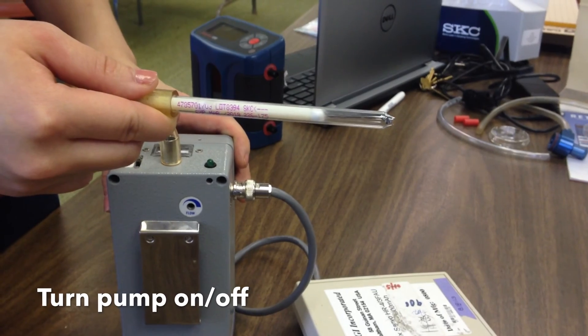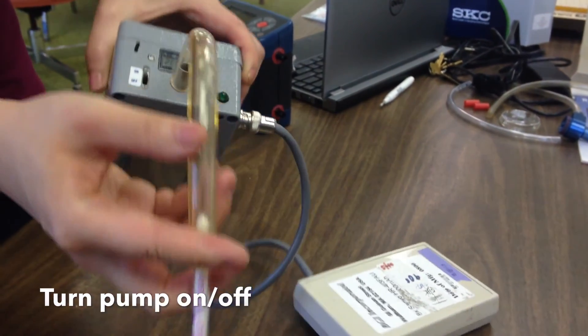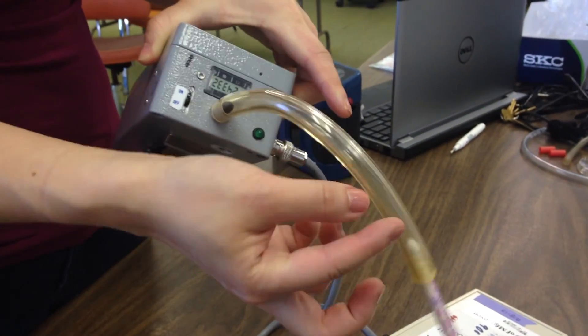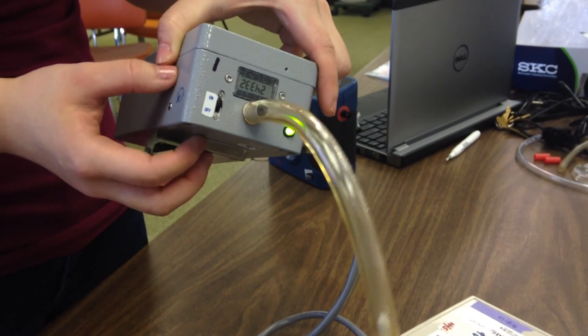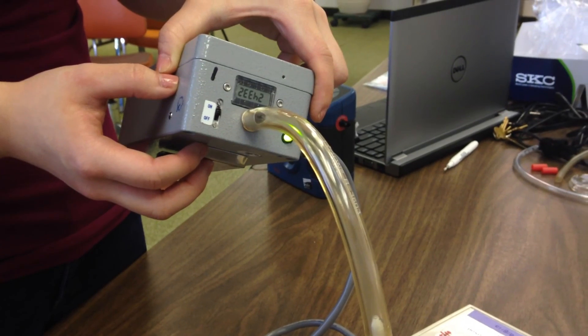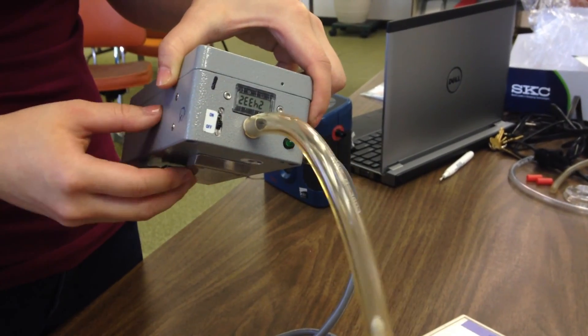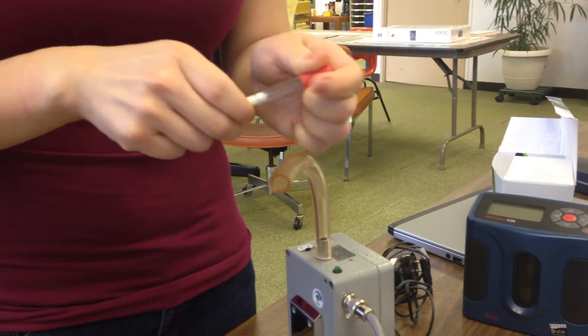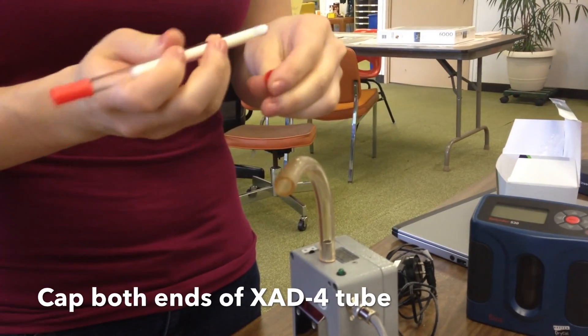In order to begin sampling, both ends of the XAD4 tube must be broken with the arrow pointing inwards towards the pump. Switch the pump on to begin sampling and switch it off to end it. After sampling has ended, cap both ends of the XAD4 tube.